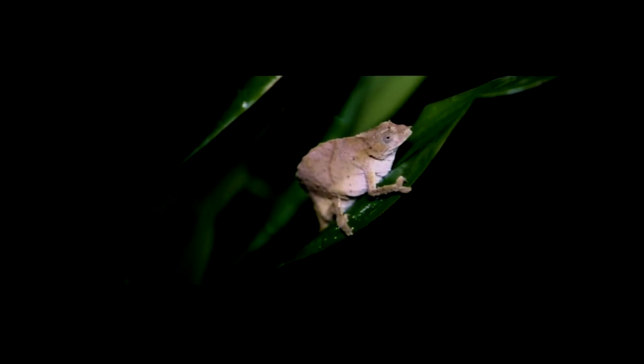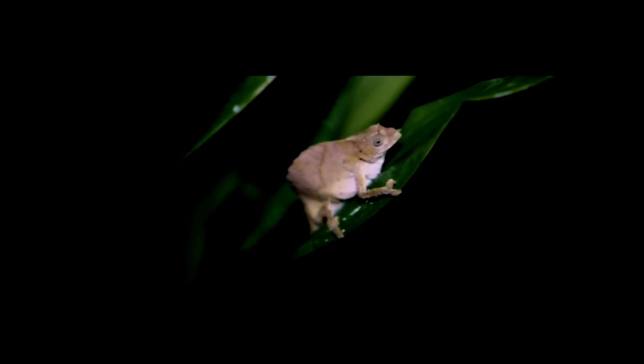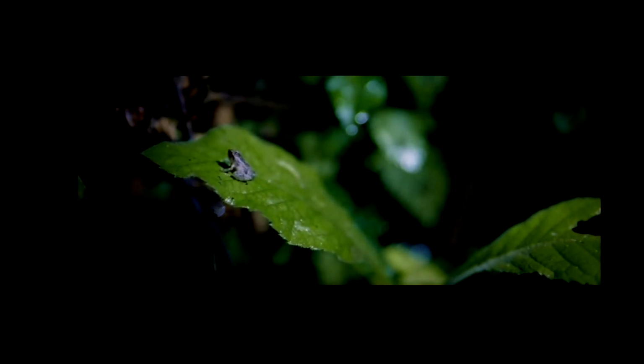We are currently in the midst of a biodiversity crisis, and most of the biodiversity of the world is concentrated in the tropical belt. Until now, it was impossible or very difficult to take organisms from tropical areas and bring them to labs in the most developed parts of the world. Now it's possible to take the lab to places like this, where most of the biodiversity actually is present, and to sequence them in order to get extremely important information for their conservation.